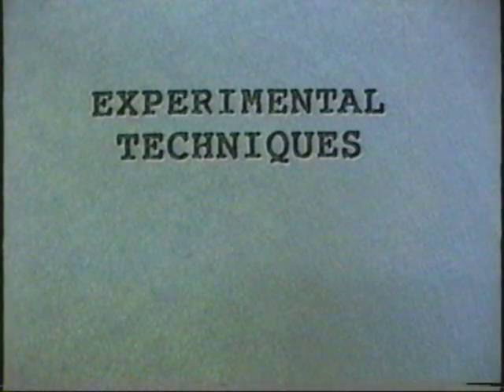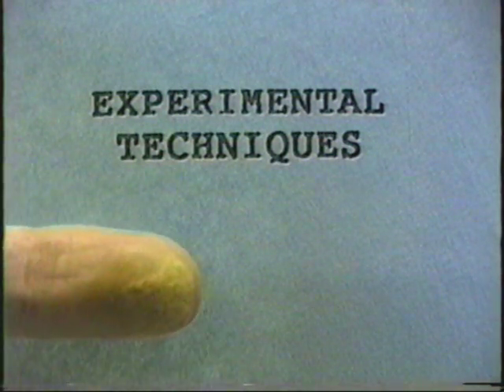Now let's turn our attention to the experimental details of this analysis. First, a warning. Handle concentrated nitric acid carefully. If it gets on your skin, wash it off with plenty of water, but in any case, it'll probably stain your skin yellow, as you can see here.